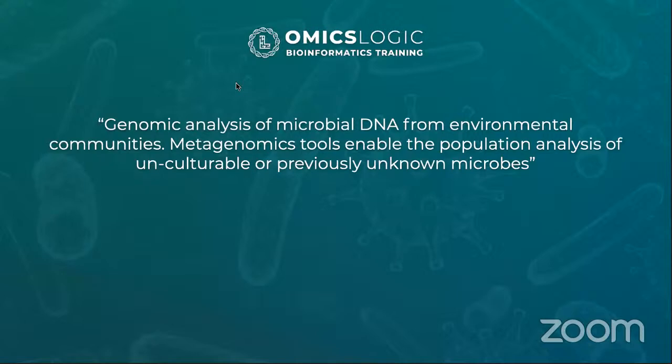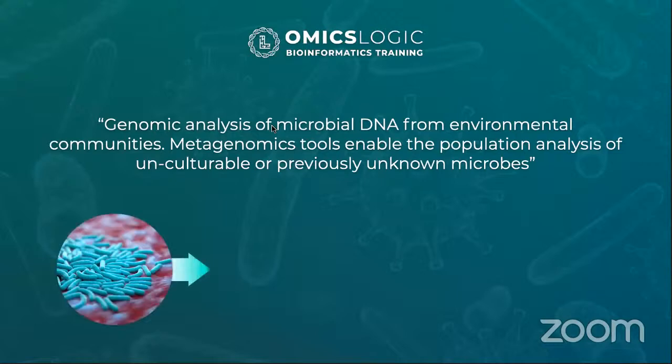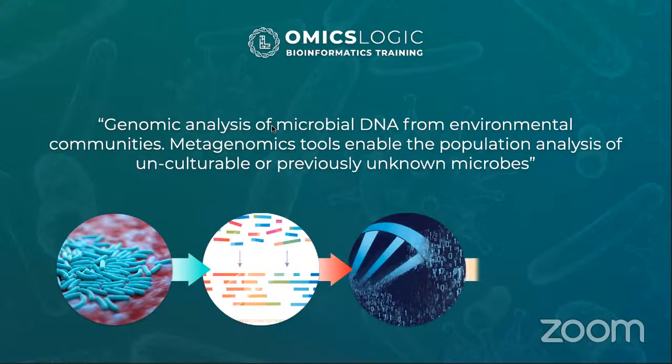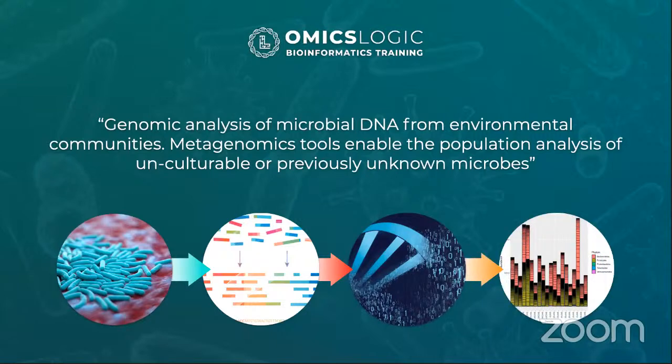So metagenomics, I think, is an exciting opportunity because it really provides a snapshot into how these communities that live and function together as almost like an organ could be studied using next generation sequencing. So we can gain insight into composition, species diversity and richness, and understand the functional applications of metagenomics.